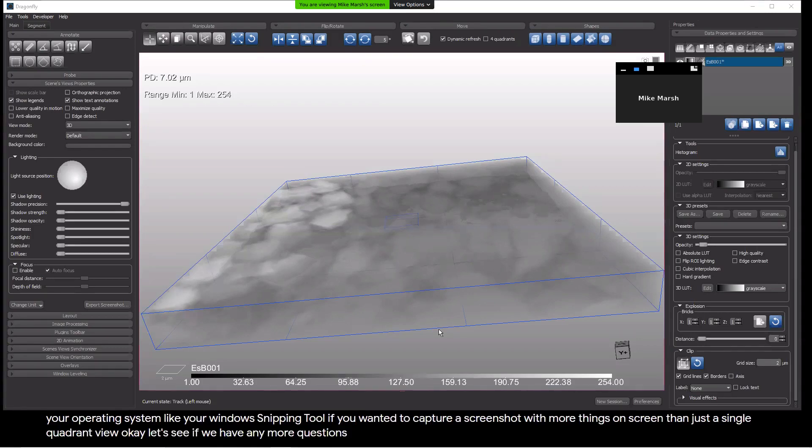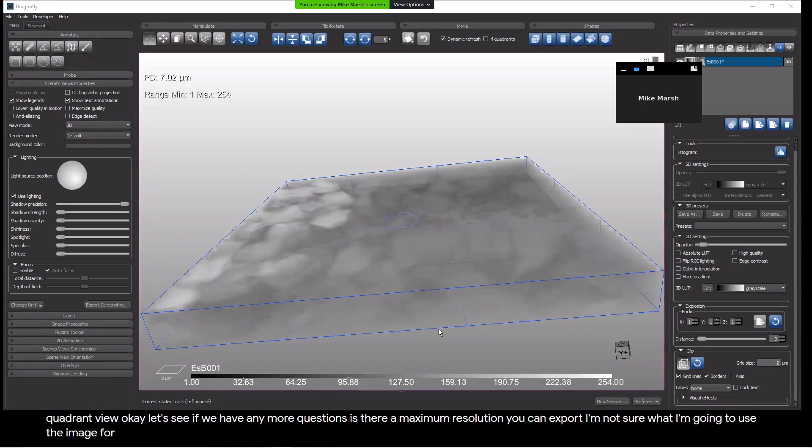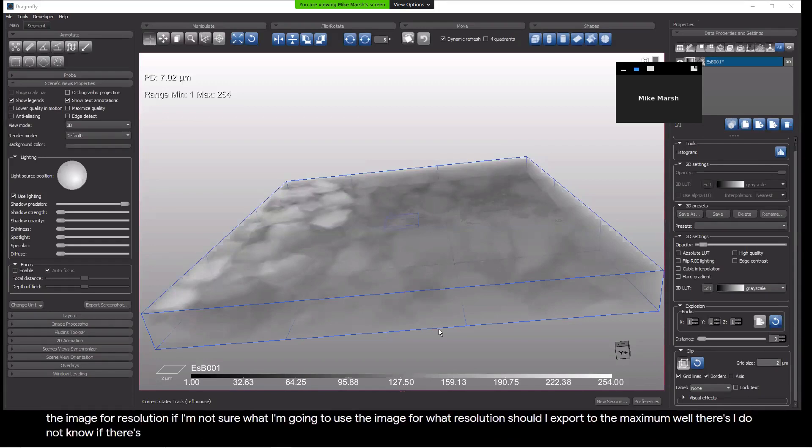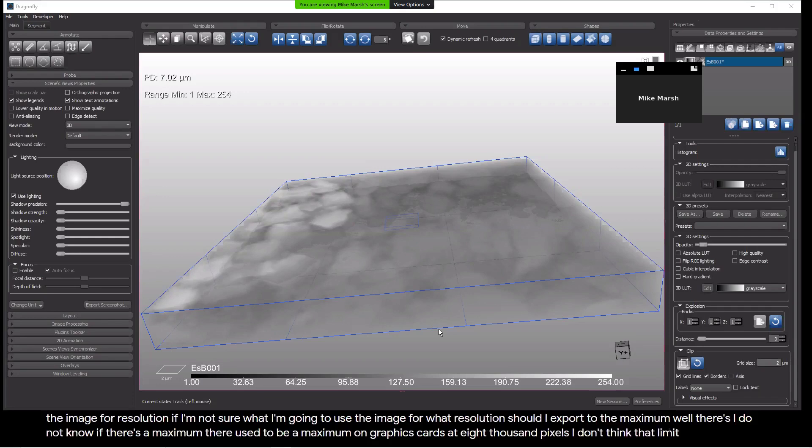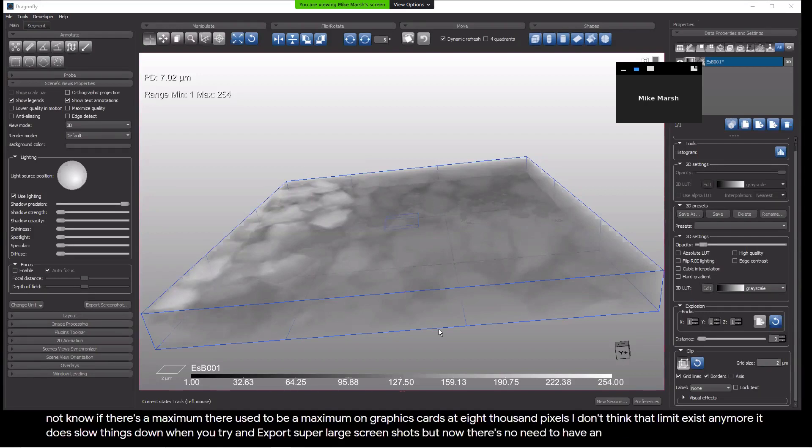Is there a maximum resolution you can export? If I'm not sure what I'm going to use the image for, what resolution should I export to? The maximum? Well, I do not know if there's a maximum. There used to be a maximum on graphics cards at 8,000 pixels. I don't think that limit exists anymore. It does slow things down when you try and export super large screenshots. But no, there's no need to have an 8,000 pixel screenshot. If you don't know what you're going to use them for, maybe it's premature to be taking screenshots of that.